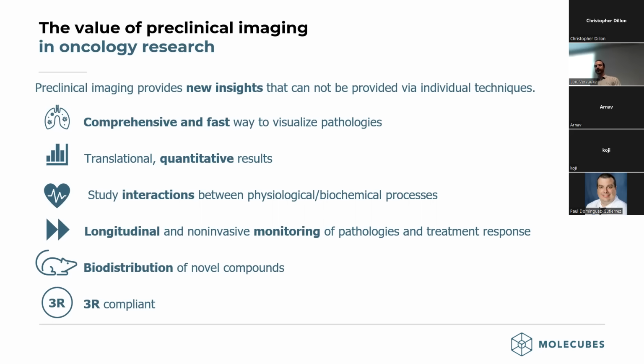Thirdly, preclinical imaging studies the interactions between physiological and biochemical processes, and this can be done longitudinally over time. You can monitor a set of animals or a single animal at multiple time points, similarly to optical imaging, with the added benefit that each animal serves as its own control, which adds extra statistical relevance.